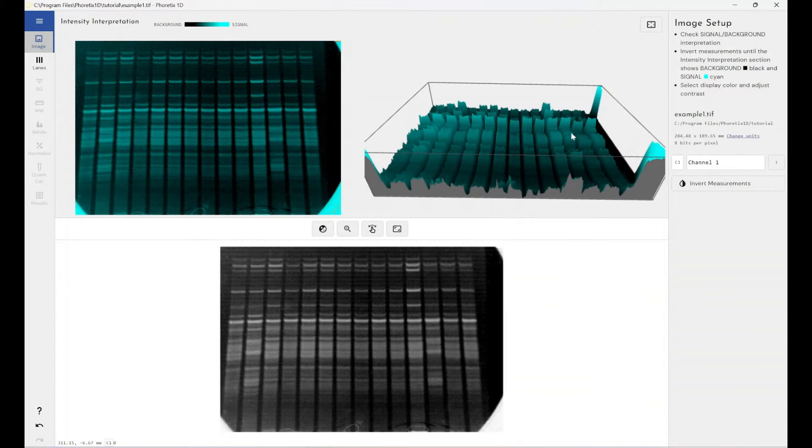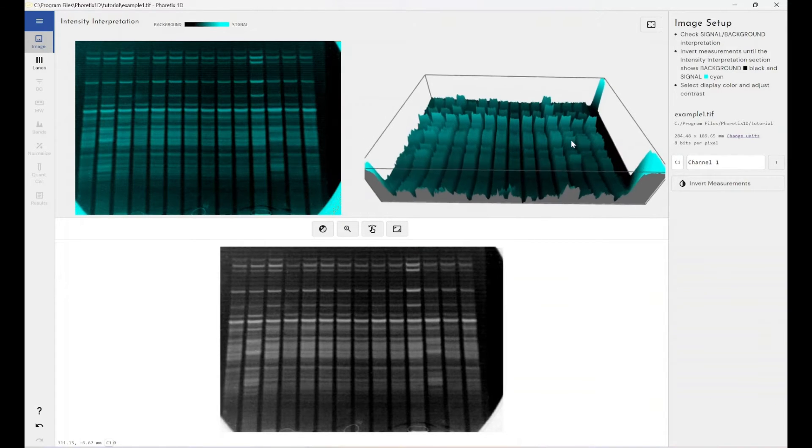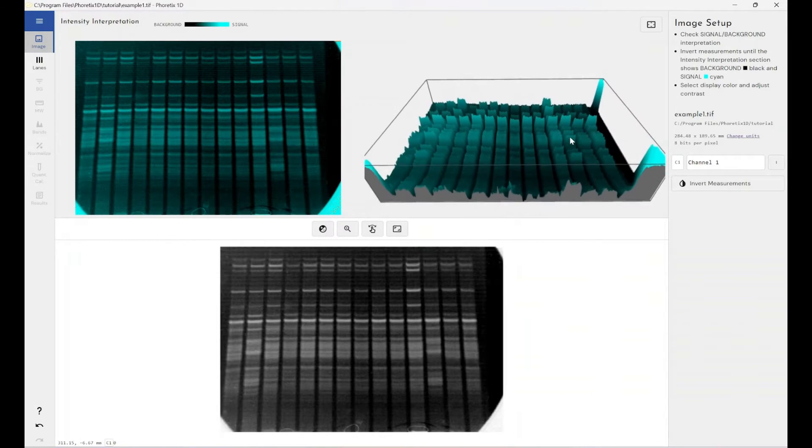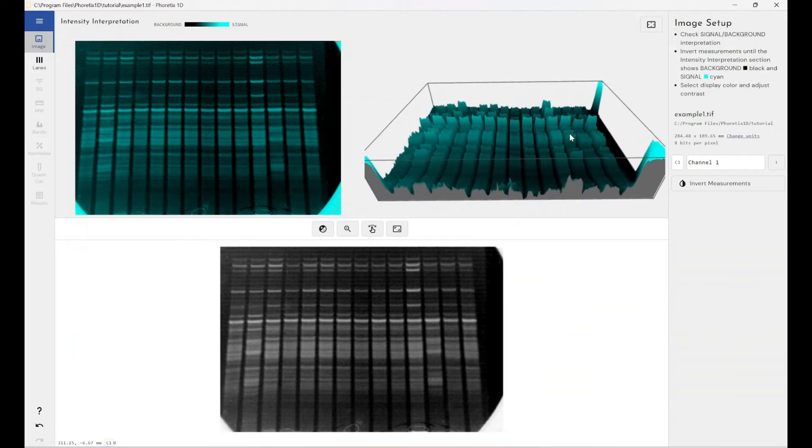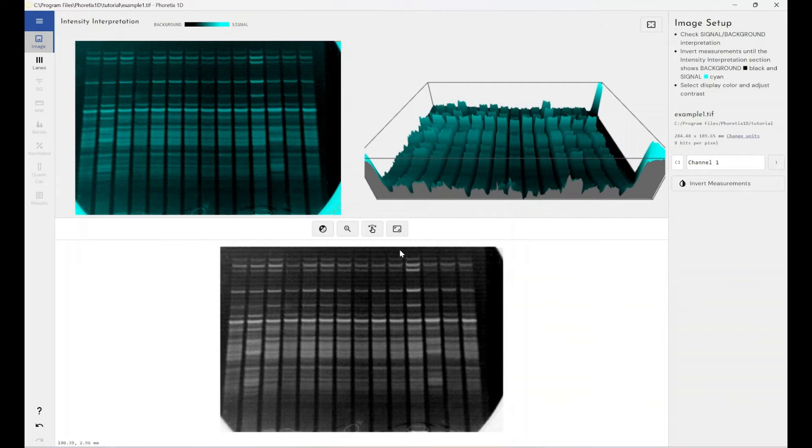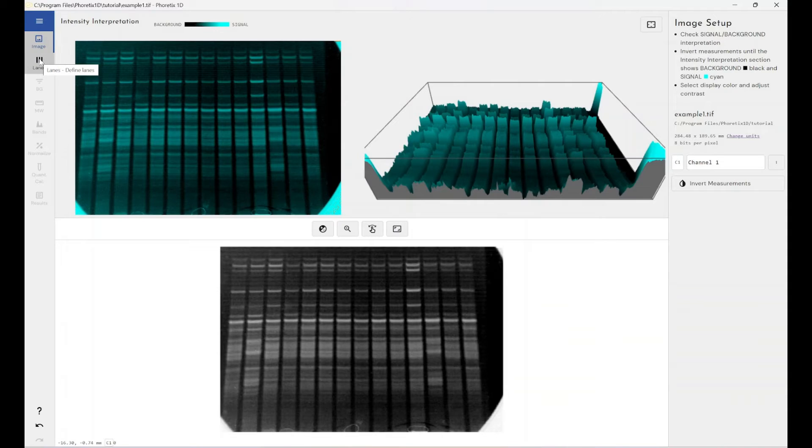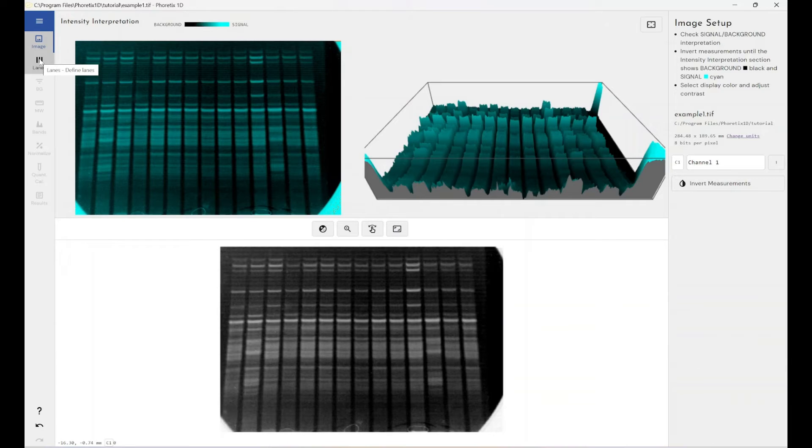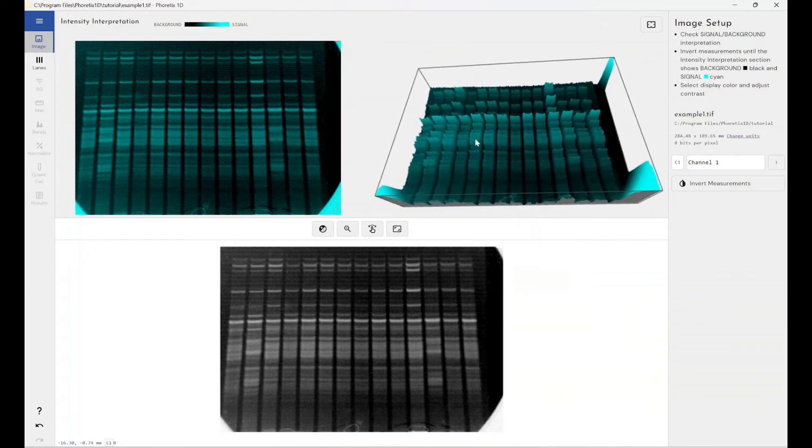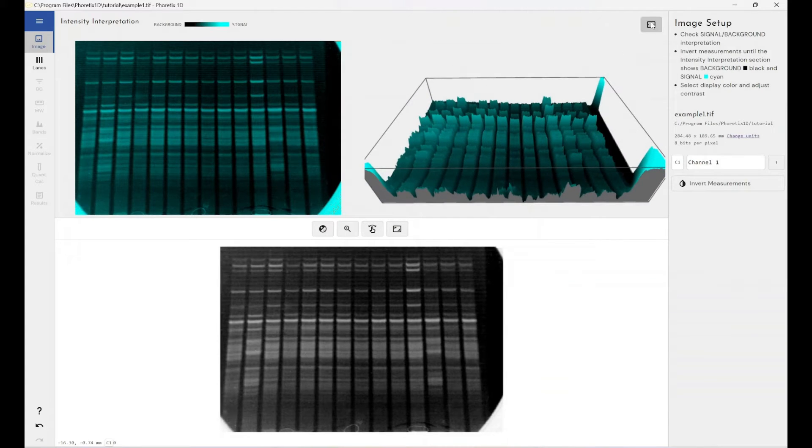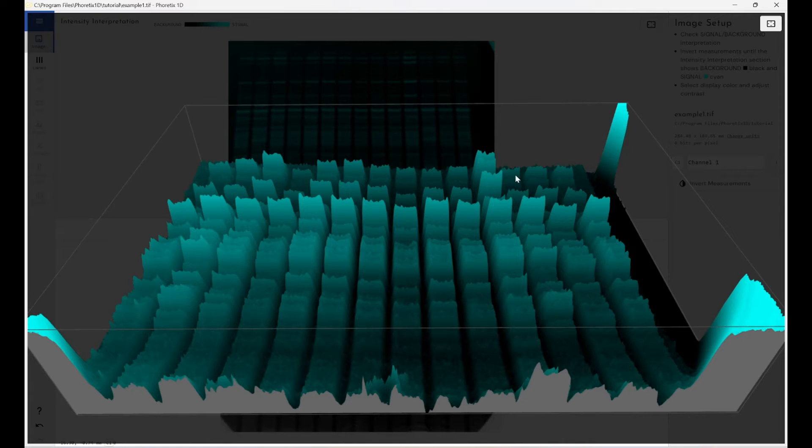So the first example is a single channel example, a single channel image example that we've got. And I'll just run through quickly how you would present this to students and show them how to accurately analyze a Western blot in place of their own. So we'd come through. So we've got our image here and our 3D view here.